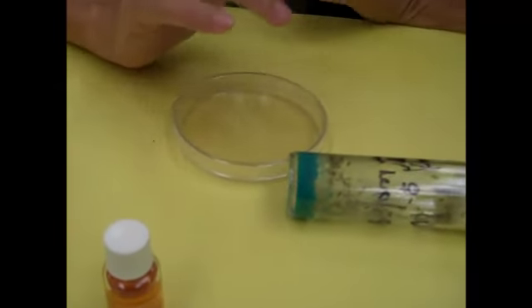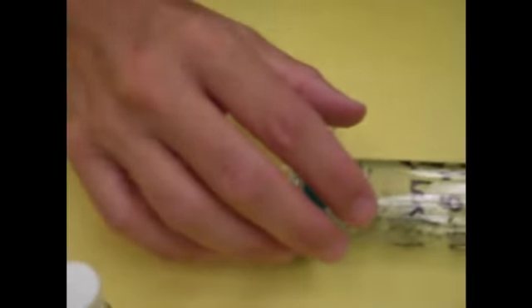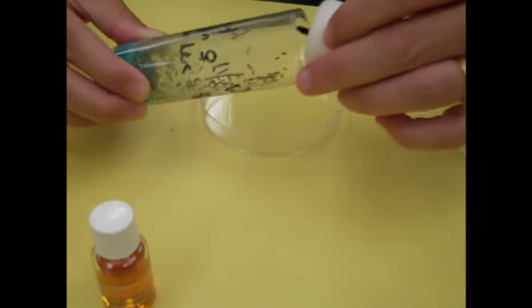put them in a petri dish, and that's what you'll want to put them in so that you can observe them under the microscope and determine males and females and so on. So I think they look like they're about ready, so I'm going to gently remove the stopper. Okay.